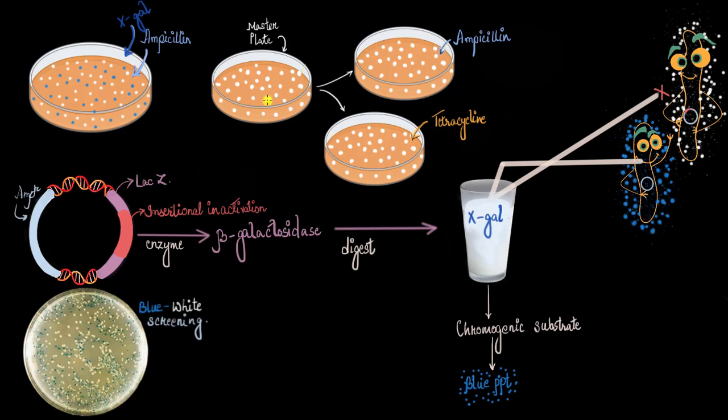Alright, now let's quickly summarize what we learned in this video. We have learned that instead of an antibiotic-resistant gene, we can use an enzyme-producing gene as a selectable marker. Here we discussed the Lac Z gene that produces the beta-galactosidase enzyme and that digests the chromogenic substrate X-gal, and on being digested, it produces blue precipitates, and that is how we find blue colonies in our petri dish. And the cells that have an insert that do not digest X-gal appear to be white in the petri dish. That is how we see blue and white colonies in our petri dish, and we call it blue-white screening.